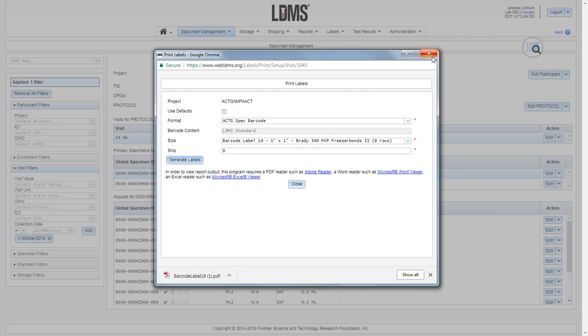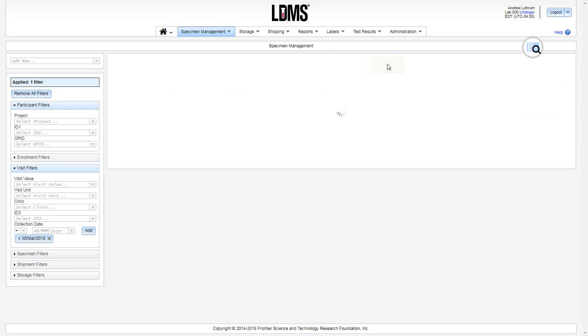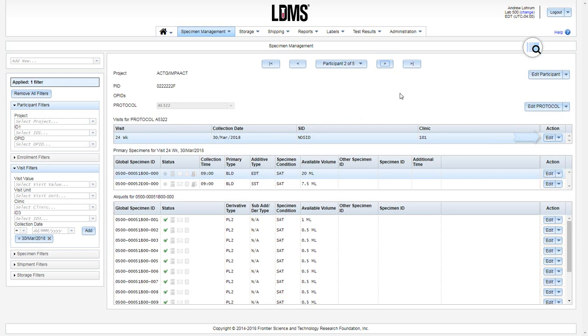After generating labels for this one visit, use the right arrow button by the participant counter and then you can move to the next participant collected that day and generate labels from that visit. Continue for all of the participants that you collected specimens for on that date.